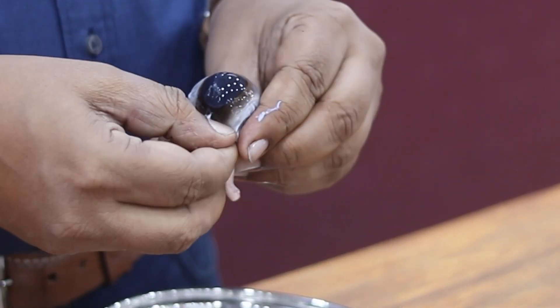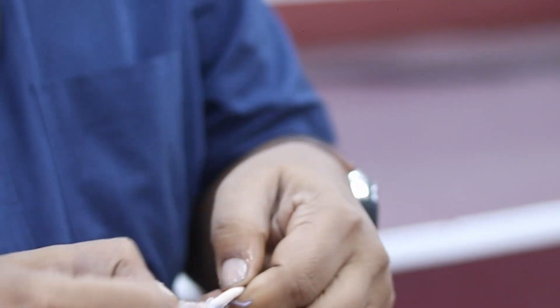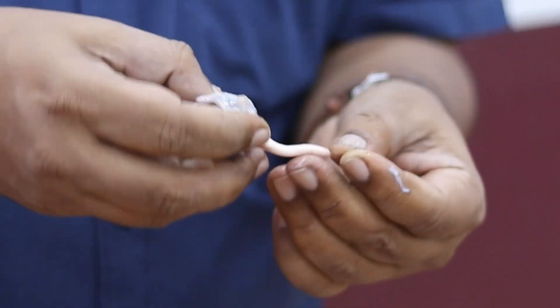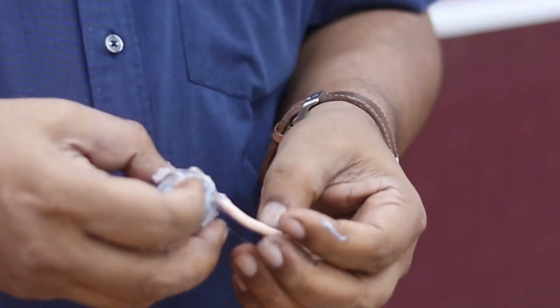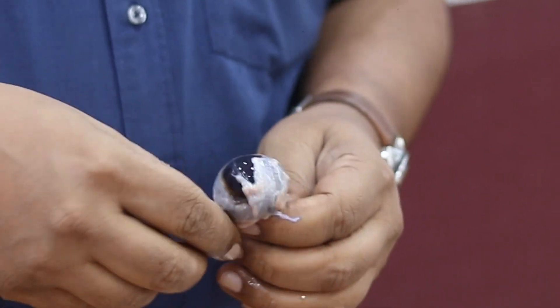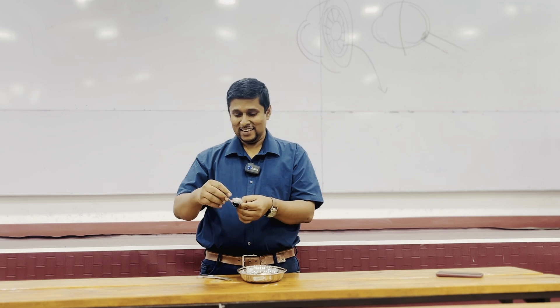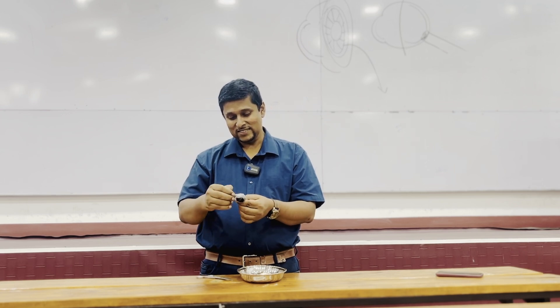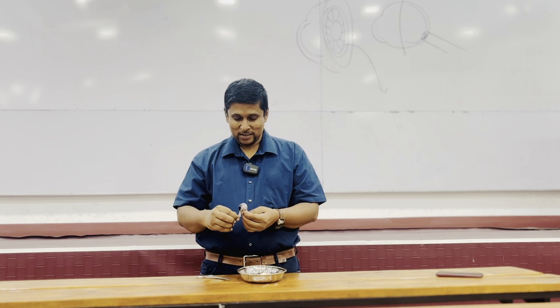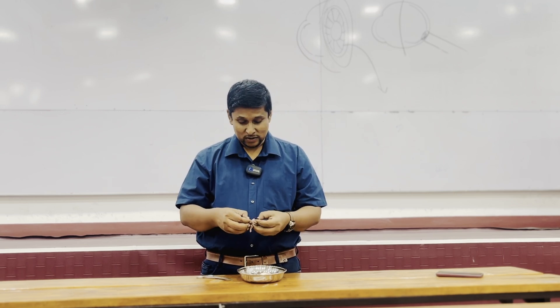Beautiful bovine eye! This side — the optic nerve — is a part of the central nervous system. It's covered with all three meninges, which is why we consider it as a part of the central nervous system. The eye is clean and all the extraocular or extrinsic muscles have been removed. Now it's time to open this to see the parts inside.